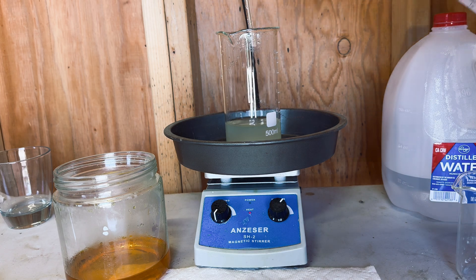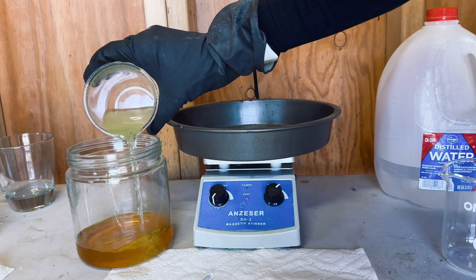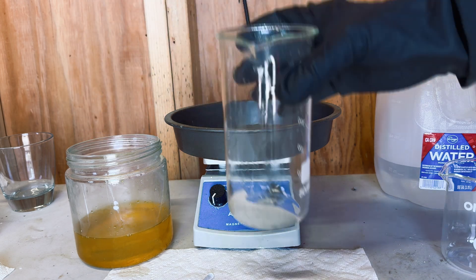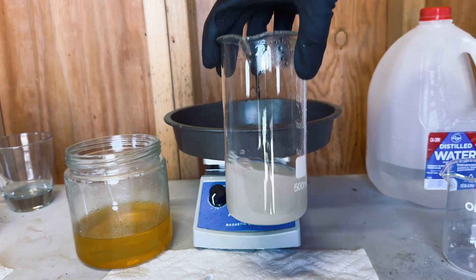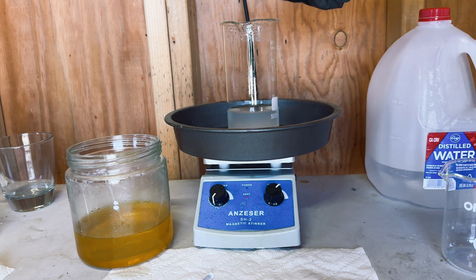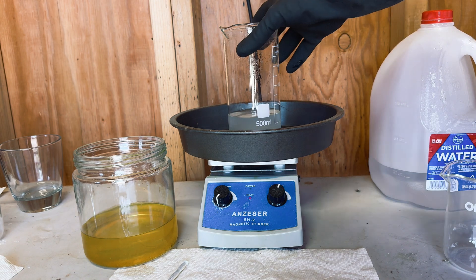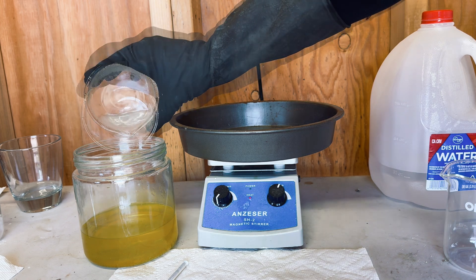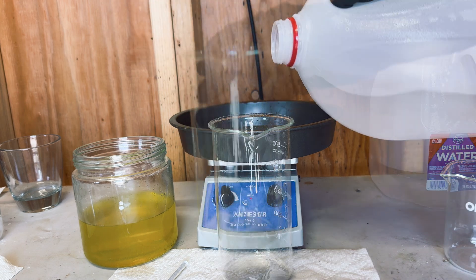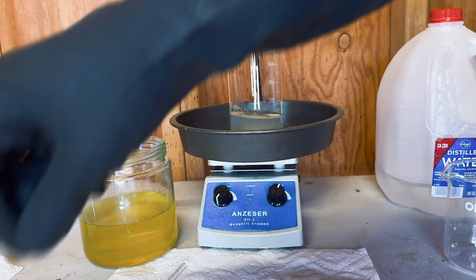After our hydrochloric wash, I rinse the material out three times with distilled water. What I do is pour the water in, turn the hot plate on high and let it begin to boil, then turn the temperature back down, let it cool off, and then do the second and the third rinse.